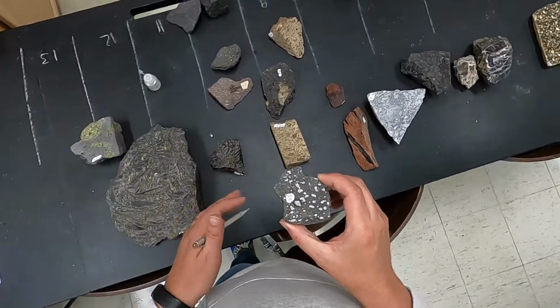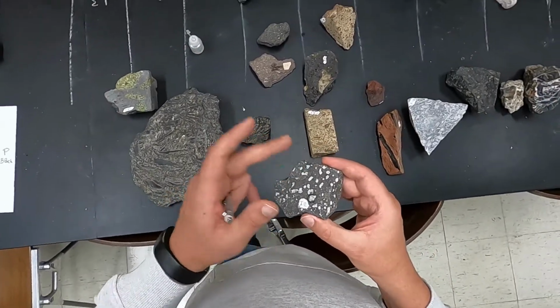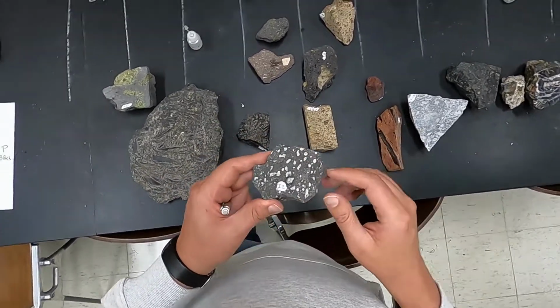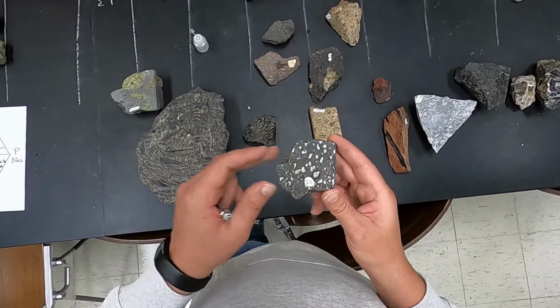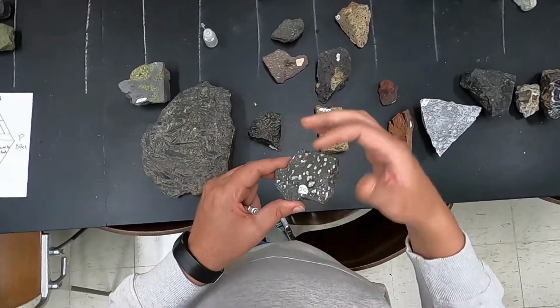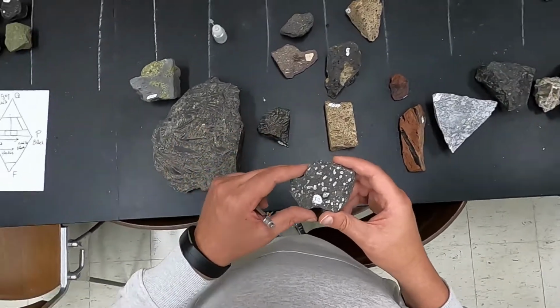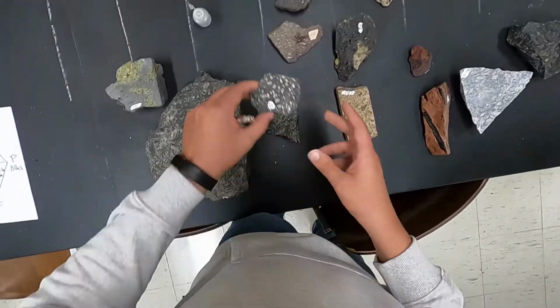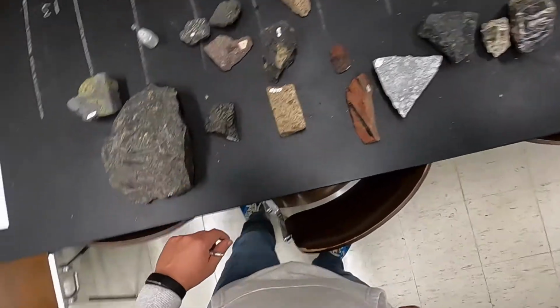So for the description of these rocks, it's important to describe the microgranular matrix and think of this rock as likely either an andesite or a basalt, and then discuss the vesicles that form and their composition, and that would be enough really, and the shape of the vesicles as well.